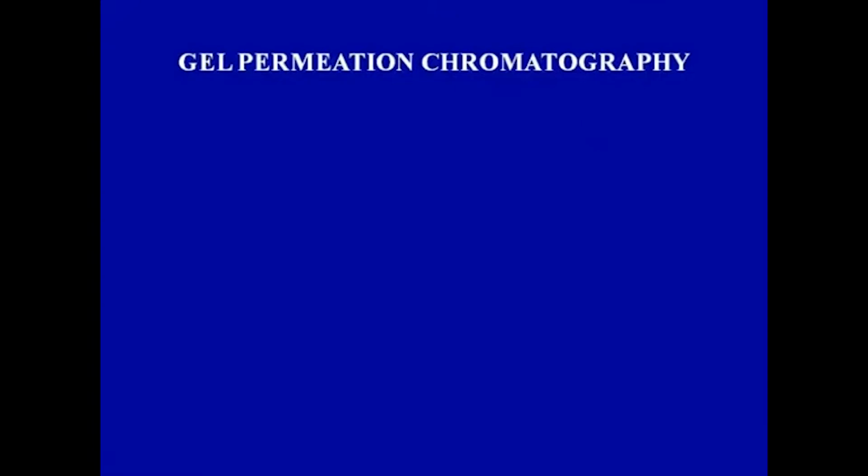In the previous lecture we discussed ion exchange chromatography. In ion exchange chromatography, the property of charge which a particular analyte carries on itself is utilized for the separation procedure. Now in this lecture we are going to discuss another important chromatographic method, that is gel permeation chromatography.